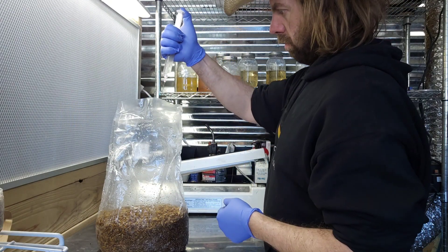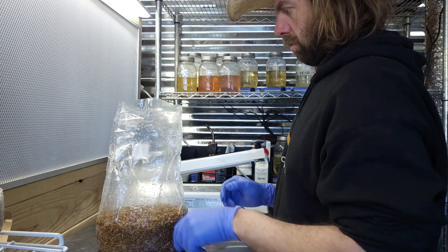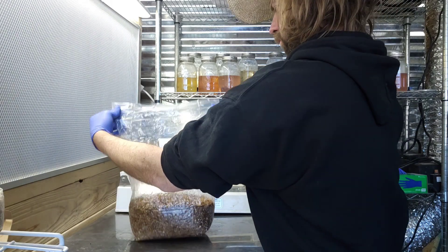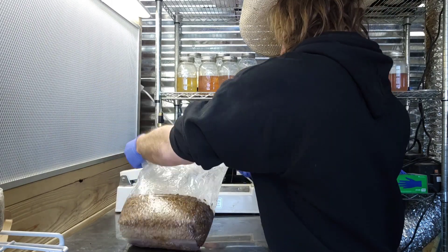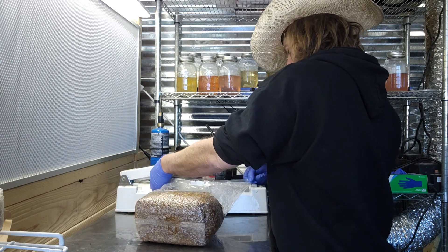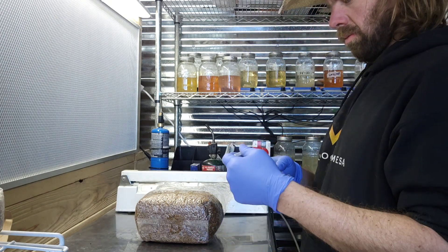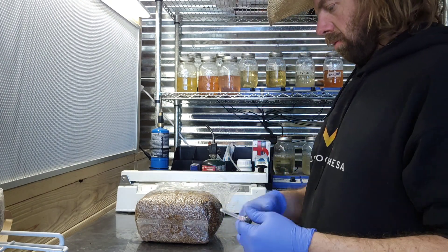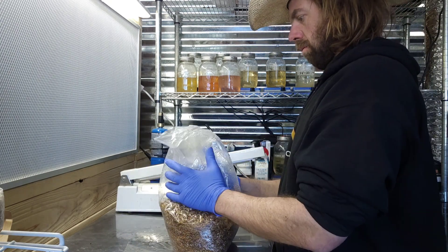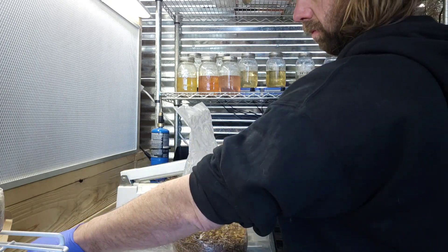Now I open the bag in front of the flow hood — we're working with sterile grain — and I squirt that culture all over the grain. Then I get rid of that needle. I like to open up the gussets on the grain bags — you can see I've got the gussets actually pulled out. I lay it over on its side and seal it with my impulse sealer, which is a magnetic impulse sealer with a magnetic latching locking mechanism. Then I pressure test the bag to make sure I don't have any leaks and have a good seal.